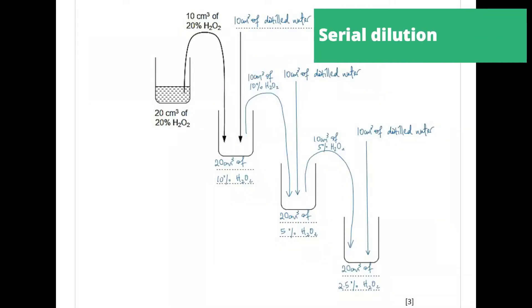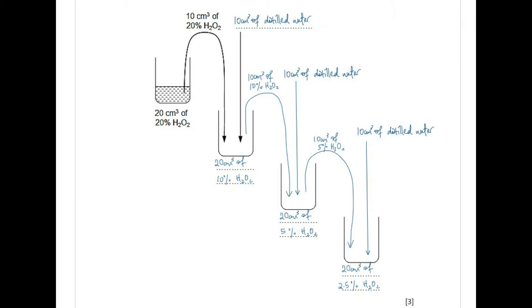As we mentioned just now, we are going to make a range of concentrations using serial dilution. In this case, we are going to half the concentration each time. So we have 20%, 10%, 5%, 2.5% in this experiment. To do this, we add an equal amount of the previous solution to an equal amount of distilled water. So 10 cm cubed to 10 cm cubed.